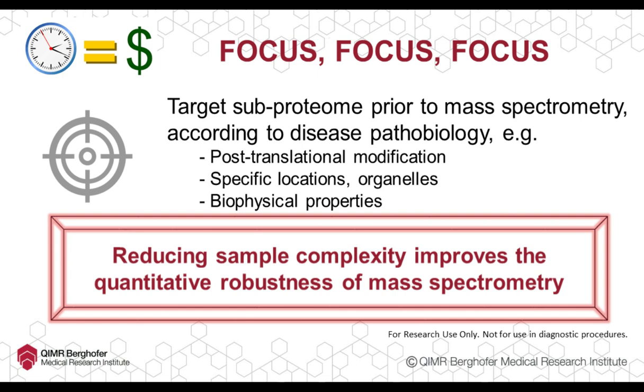So, but still, there are a lot of proteins in different biological samples, particularly if one is looking at plasma or serum samples, which are arguably a very common sample for biomarkers, and an easy sample type for, for example, a clinical diagnostic test. So one might want to use that as a preferred sample type for clinical proteomics research. So how do we deal with this?